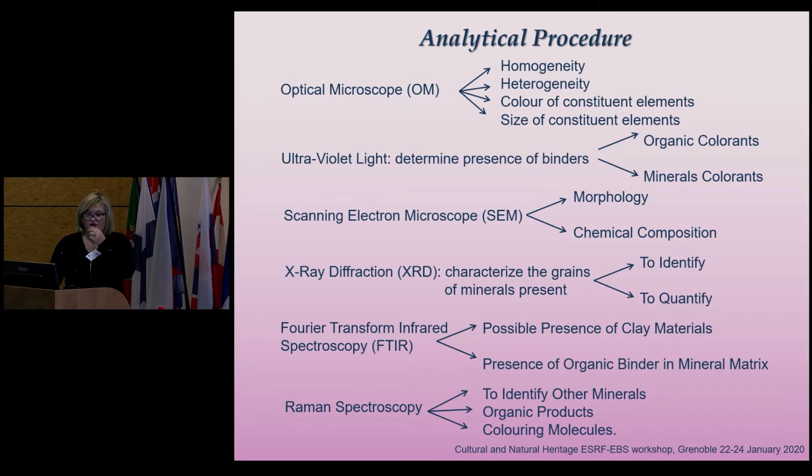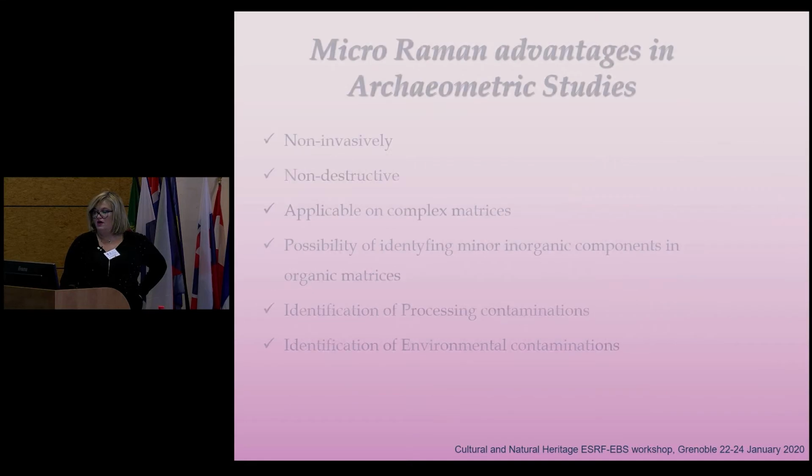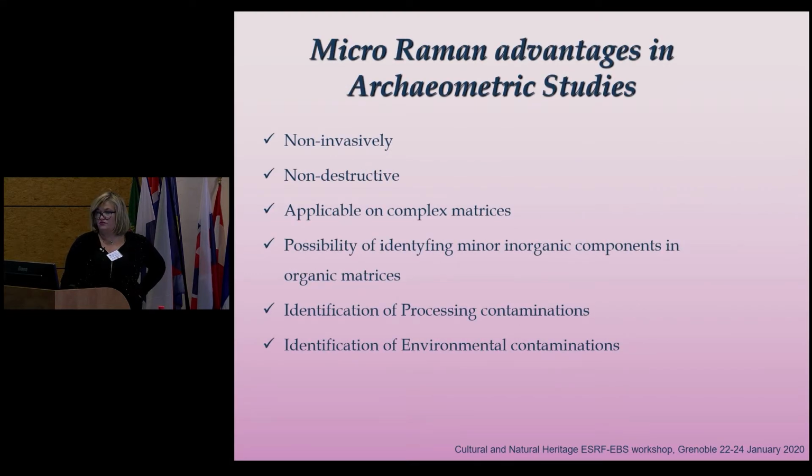And then in our lab, we use a scanning electron microscope to understand the morphology of the powder, and also X-ray diffraction to identify and quantify the powder. And we have vibrational spectroscopies, FTIR and Raman spectroscopy, as you know, to define the presence of clay, organic binders, and to identify other materials and organic compounds, also with the SERS technique. Why we also use micro-Raman spectroscopy: because it is a non-invasive and non-destructive technique, and we can use the same sample and study it with other non-invasive techniques.